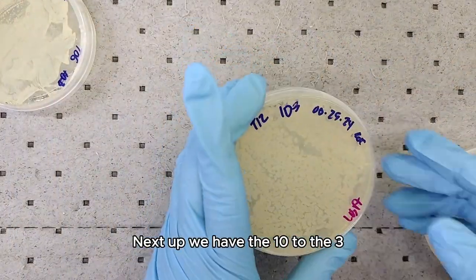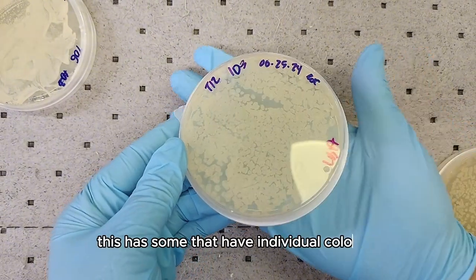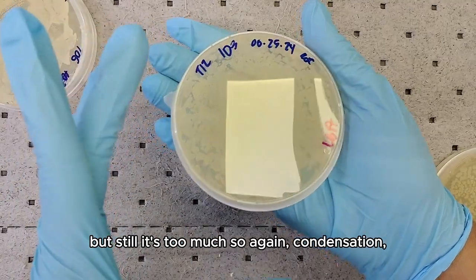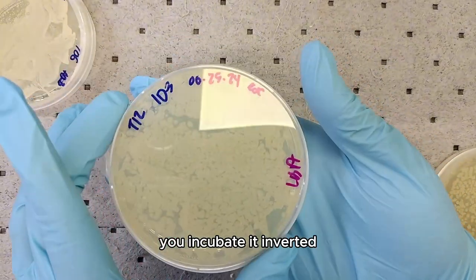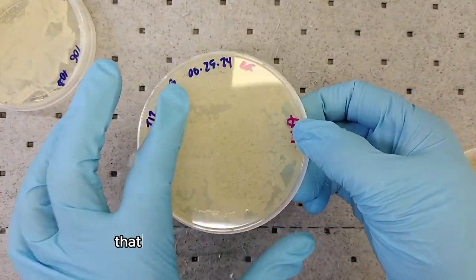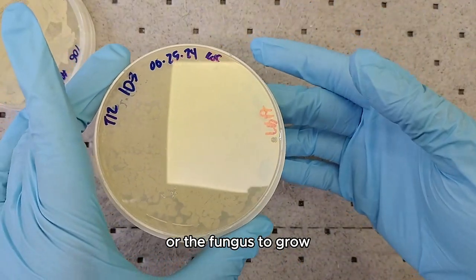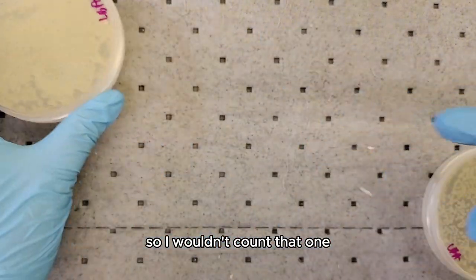Next up we have the 10 to the 3. This has some individual colonies but it's still too much. There's condensation, which is why when you incubate it, you incubate it inverted so that whatever is on the lid won't fall onto your agar that has the nutrients for the bacteria or fungus to grow. This plate has a lot, even though colonies are individualized, so I wouldn't count that one.